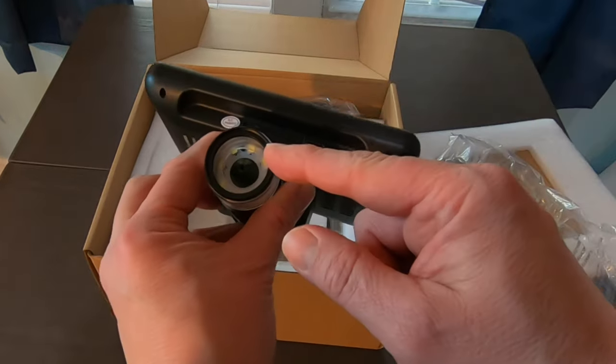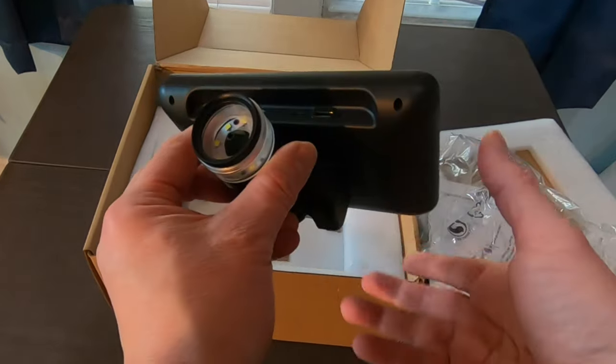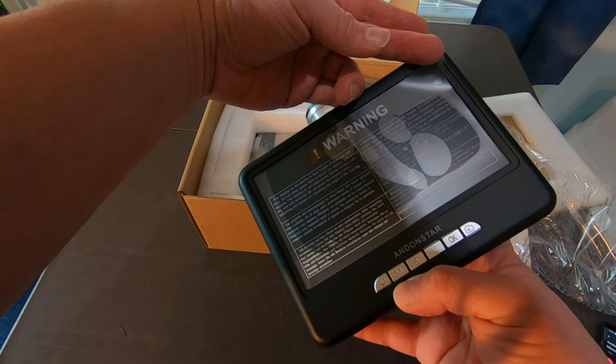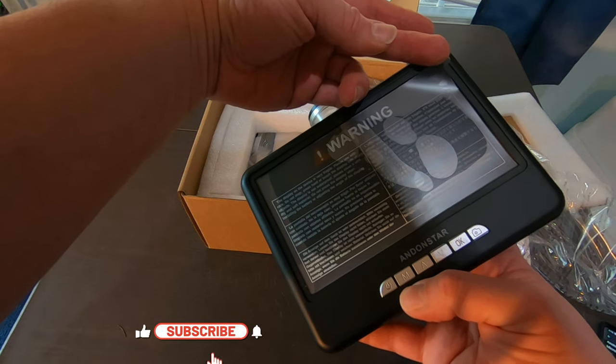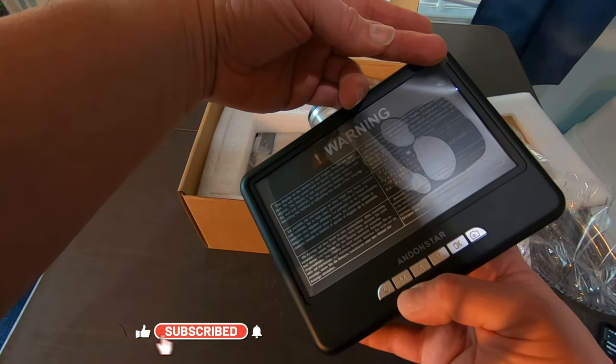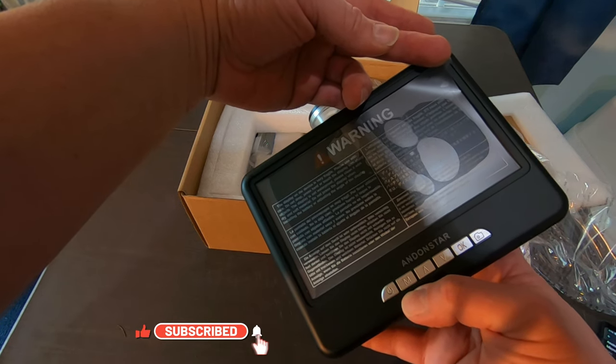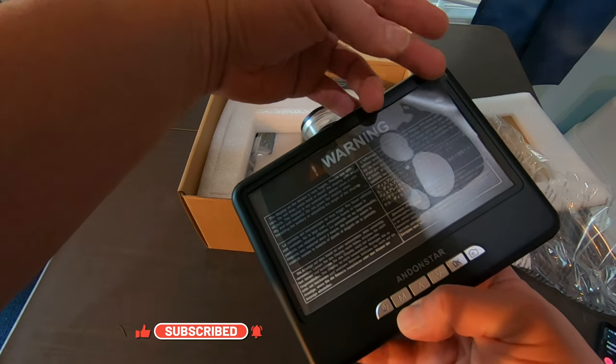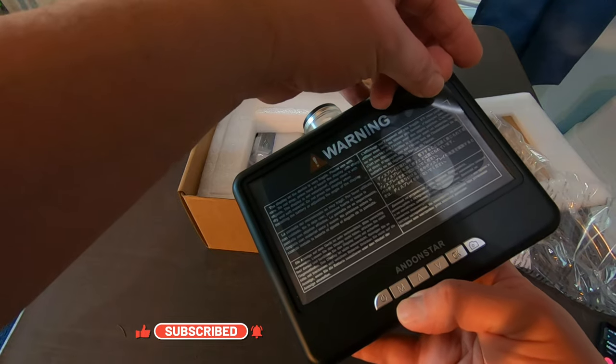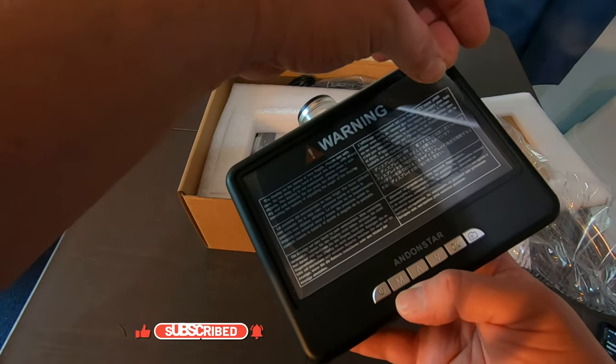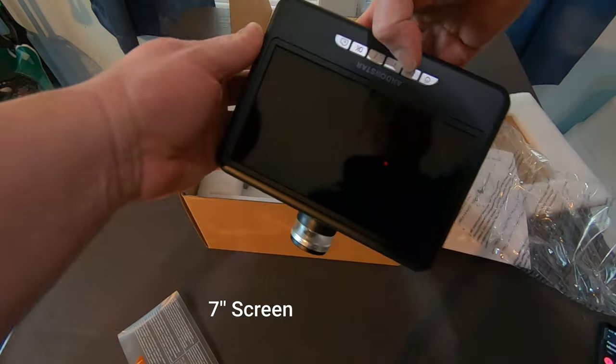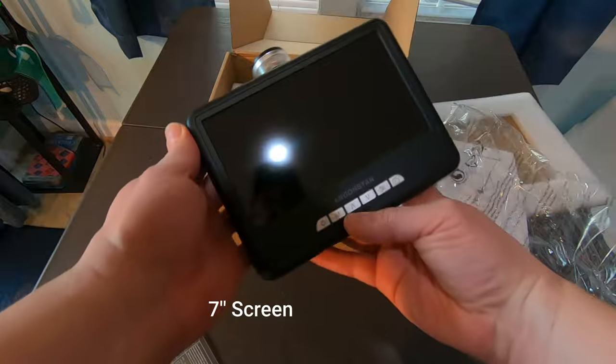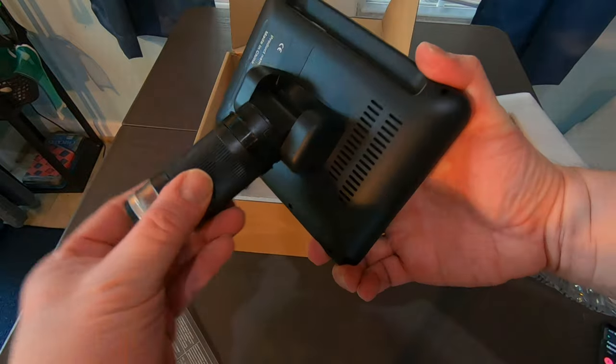Oh, there's our light. Look at that. Wow. Do not drop. Do not press or touch display with any objects. Very important. All right. So there you go, guys. Oh, that's a beautiful display, though. Look at that. That's really nice.